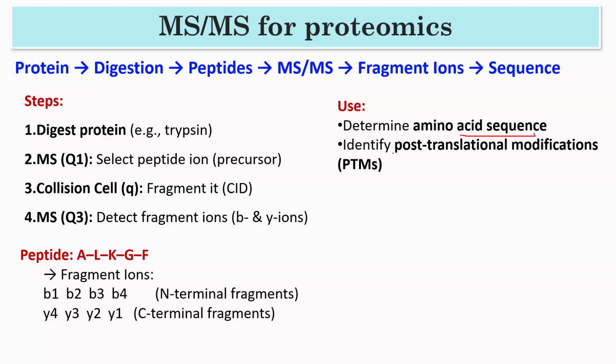Also, you can use it for identifying post-translational modifications. It's for proteins only, in any cell.